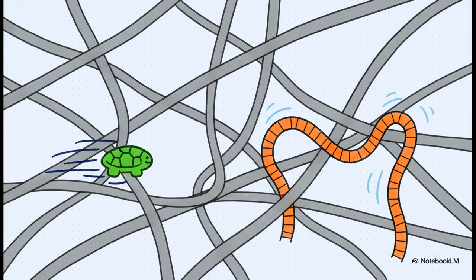So the electrophoresis race is on. Think of the gel matrix inside the tube like a really dense, thick jungle. If you're a tiny, short DNA fragment, you can easily slip right through the vines and branches, racing rapidly toward the positive charge. But if you're a much larger, heavier DNA fragment made up of hundreds of base pairs, you're going to get tangled up and move through that gel much, much more slowly. So it's a simple physical rule. The shorter the fragment, the faster it moves.